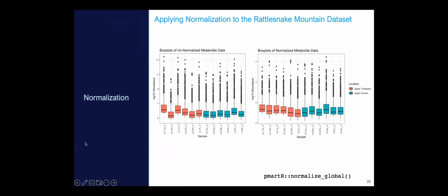Good, thank you. So after we apply the Z-score mathematical function using the RIP method at 0.15, we're able to compare the unnormalized versus the normalized data. And we see that it does a lot better job of putting all of the medians at about a similar place. It's not going to be perfect. As we saw, the best score was 0.52. And so that tells us that it might not be perfect, but out of all the data that we considered and all the SPANS normalization methods, it is the best one. Next slide.